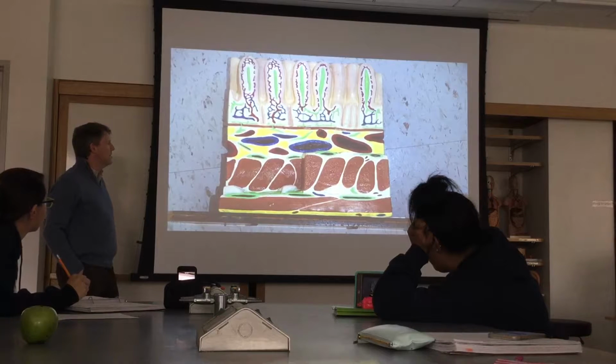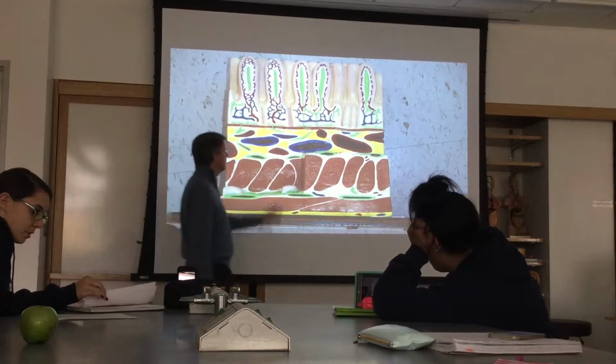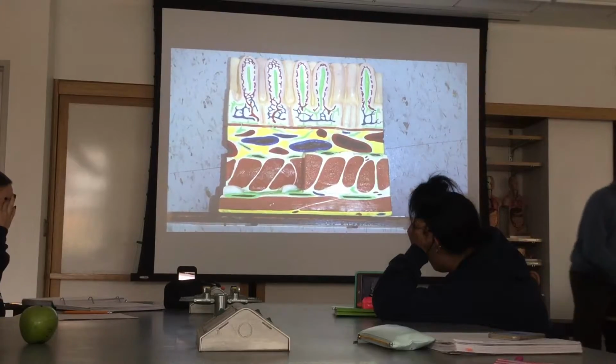Right? I promise it's not like some level in World of Warcraft. It's actually called the crypts of Lieberkühn. No idea who Lieberkühn was. All right. Anyway, that's what's going on there.